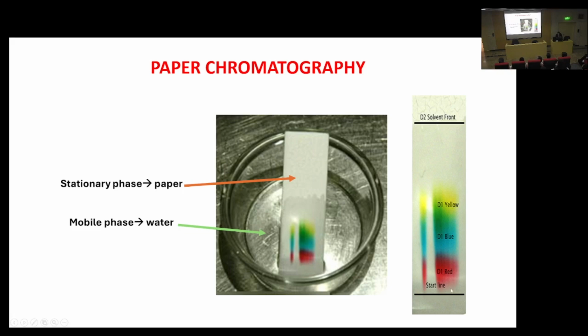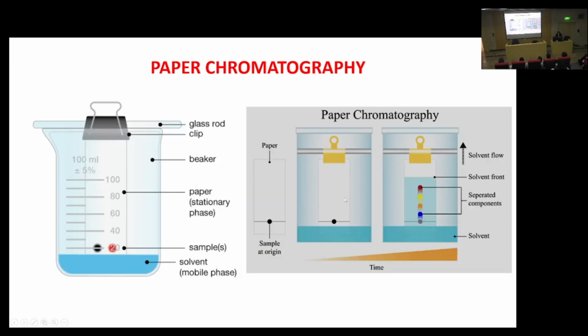So why do I want you to do a start line and a finish line or whatever? Because, once again, this is just a much better visual. If you have your beaker, you'll somehow attach this filter paper, and you'll put a dot. You'll draw a line, which will be your start line, and try not to dip the filter paper too much. So make sure that the water is below the start line, and this is your drop of ink. Eventually, the water will get absorbed by the filter paper, and this is the solvent front, basically, or the water front in this case. All right?